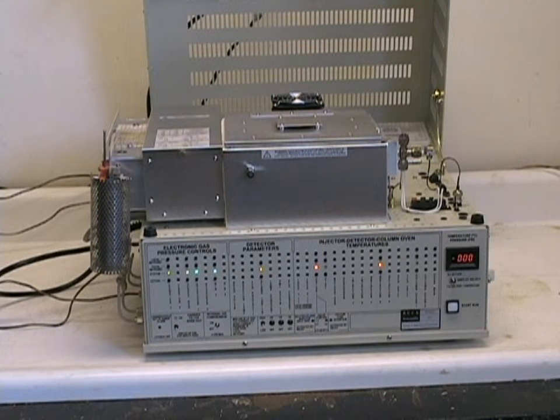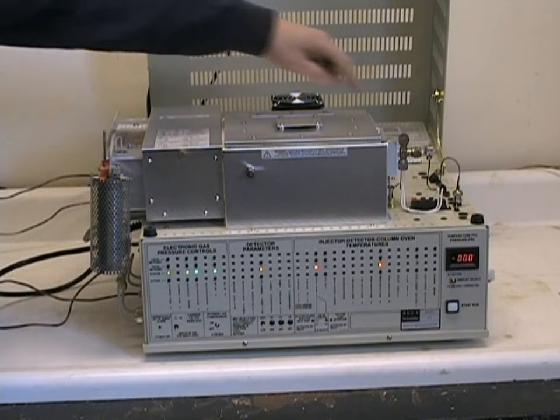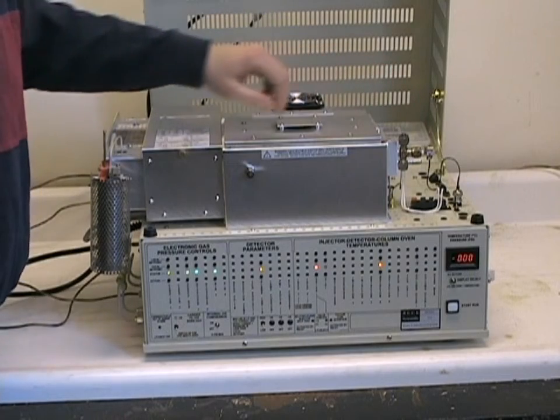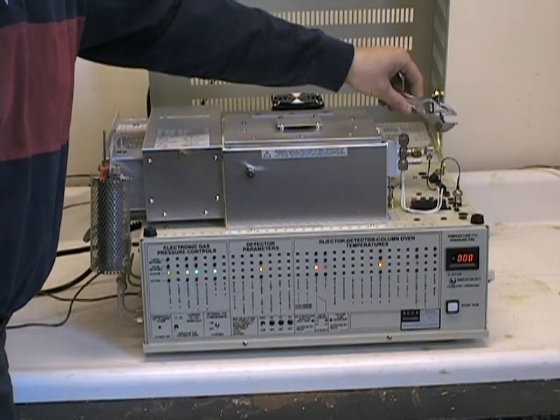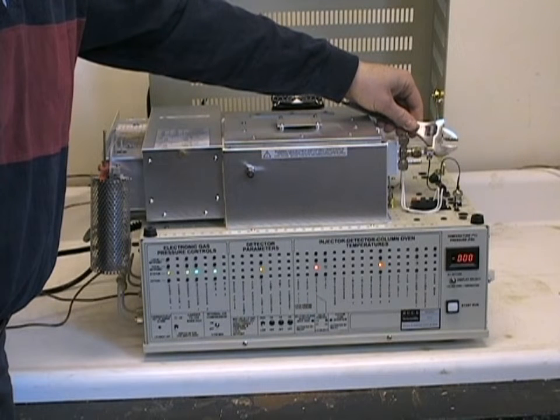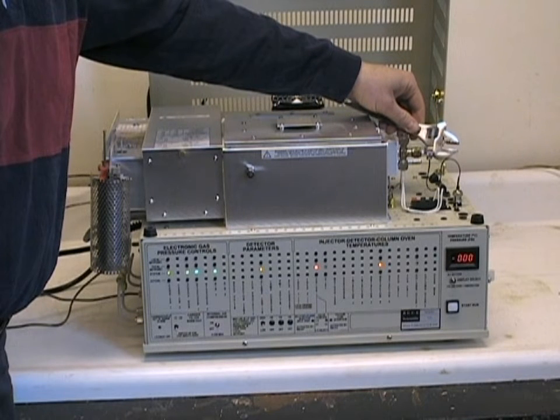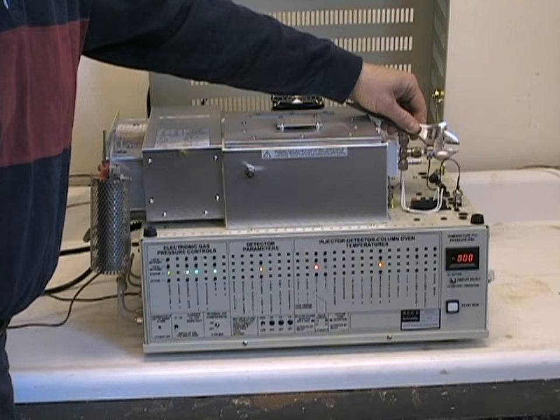The next thing to check prior to beginning our analysis is to make sure that we have steam forming at the end of the FID vent tube. Holding a piece of metal or a cold piece of glass at the end of that little steel tubing, you should see a little steam build up as we see here quite vigorously.